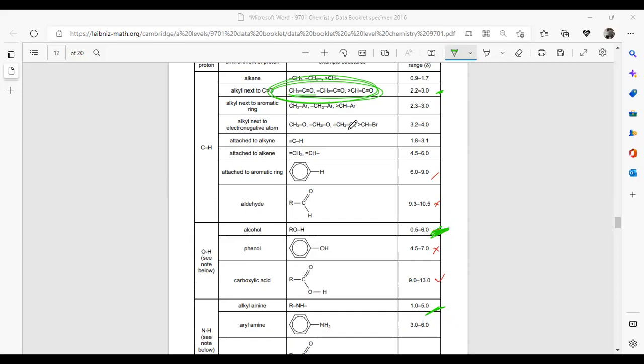So this could be a possibility that this is the molecule, and we have one carbon over here, and its neighbor is this one. This could be a possibility because we have so far got two doublets. That means this carbon's environment is this carbon and that carbon's environment is this carbon. Now, there is an alcohol group. With which part is this alcohol bonded?